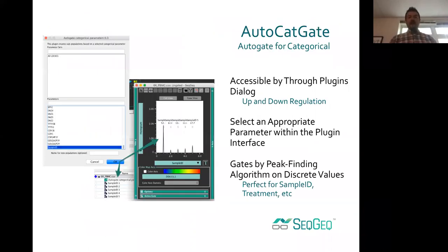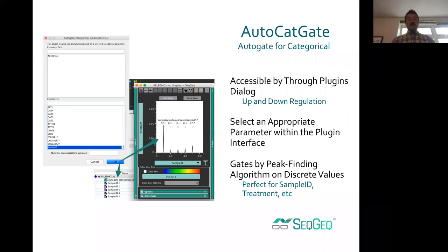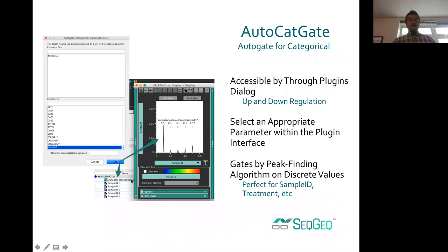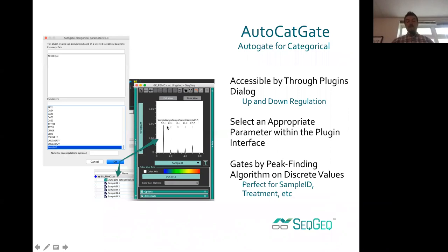The auto categorical gating plugin comes with the SeatGeek install — no need to visit the exchange, and no R dependencies. It creates subpopulations based on a categorical parameter containing integer values. Running it on the 6k PBMCs dataset, which contains five different samples, automatically gates out those five different samples. If your data set contained 30 patients, this is a really handy way to immediately identify which cells belong to which patients without drawing 30 gates manually.